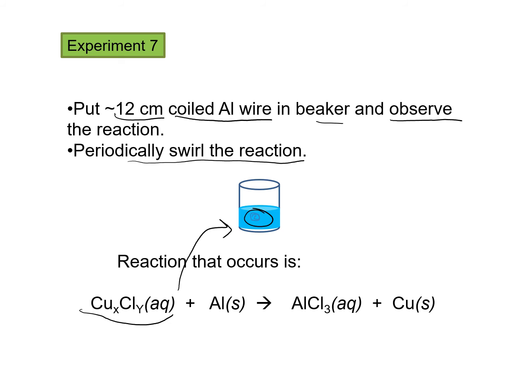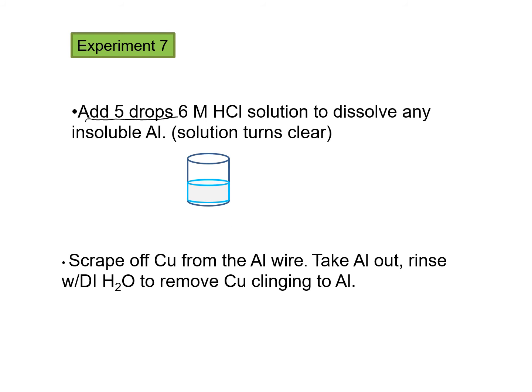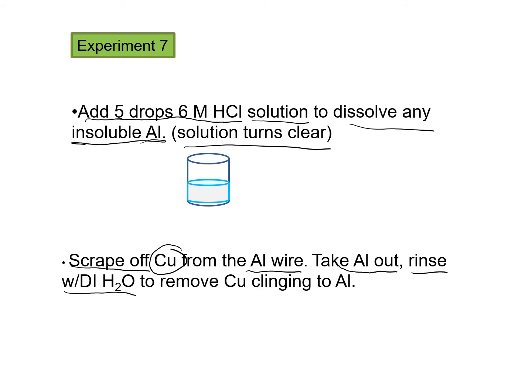Periodically swirl the reaction to keep it going. The reaction occurring is a single displacement: the copper chloride aqueous solution reacts with aluminum, forming aluminum chloride in aqueous solution — aluminum ions and chloride ions — leaving solid copper. You'll also need to add approximately five drops of 6 molar hydrochloric acid to dissolve any aluminum that was not soluble; your solution should turn clear at this point. The copper will be clinging to the aluminum wire, so scrape it off using your glass stirring rod. Then rinse the aluminum wire remnants over the beaker with DI water to remove any copper clinging to it — collect all the copper you have created.